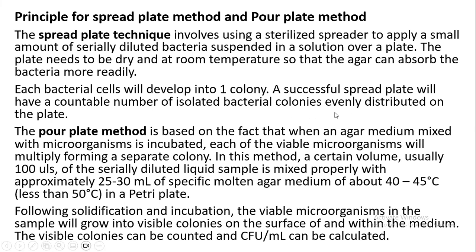Coming to the principle for both methods, the spread plate technique involves using a sterilized glass spreader to apply and spread a serially diluted sample of bacterial suspension over a sterile nutrient agar plate. The plate needs to be dry and at room temperature so that the agar can readily absorb the moisture. Later, after incubation, each bacterial cell will develop into one colony. A successful spread plate will have a countable number of isolated bacterial colonies that are evenly distributed on the plate.